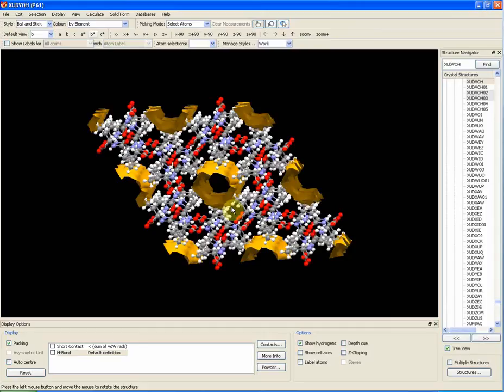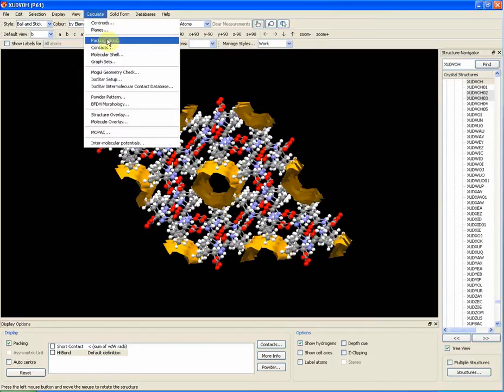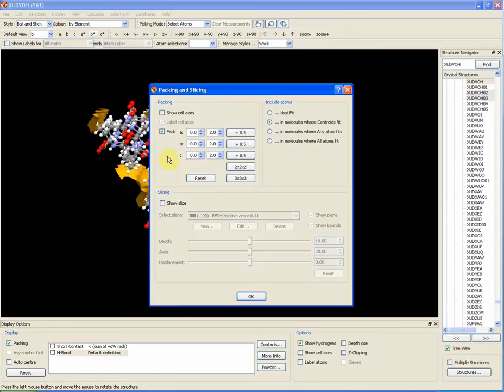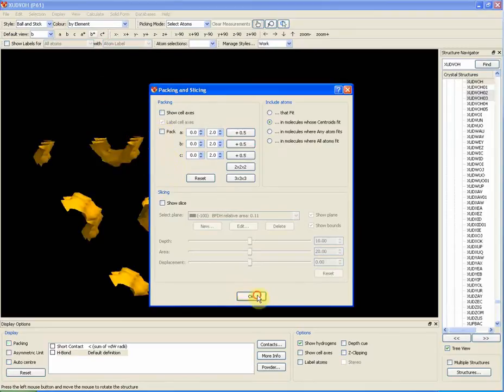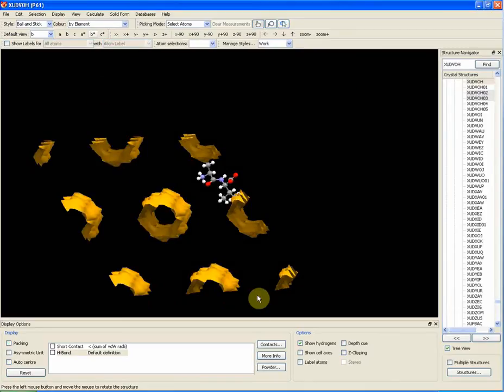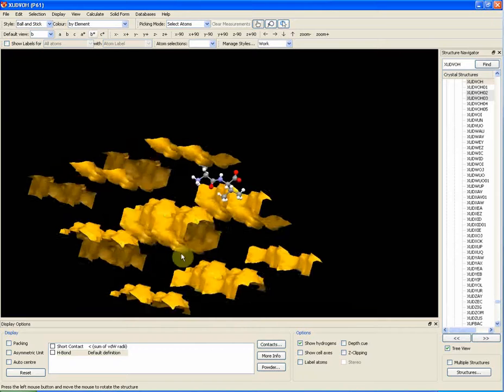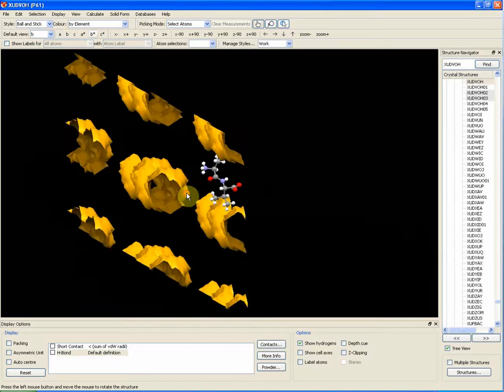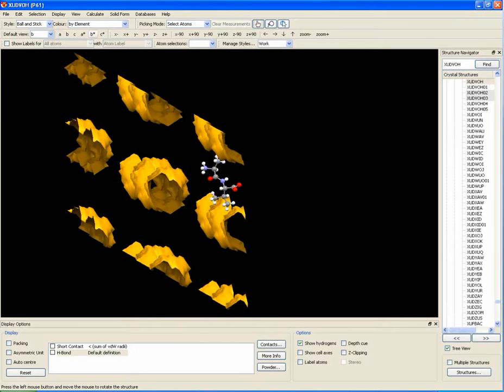These channels could hold small solvent molecules like methanol or acetone. You can turn off the pack option like this to fully visualize the shape of the void channels.